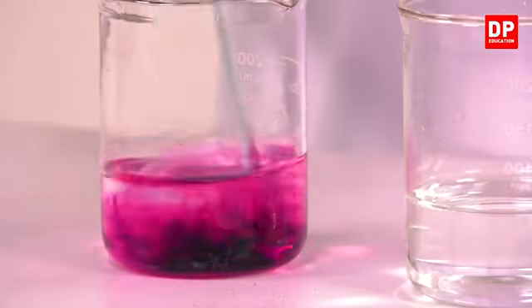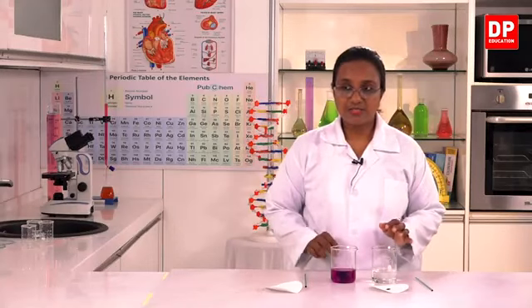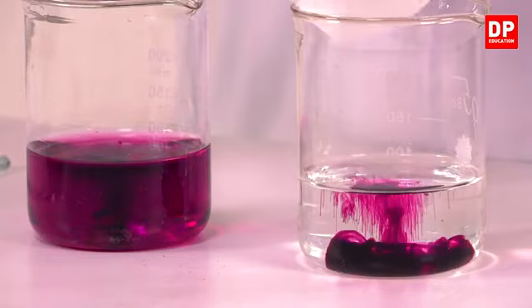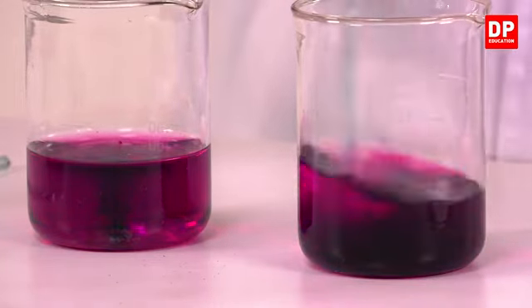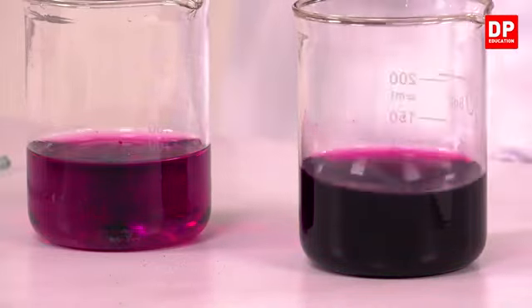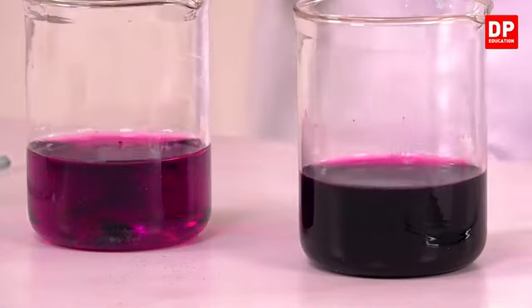So, here you can see it is a purple color solution. At the same time, I will dissolve a large amount of potassium permanganate, and when we dissolve that, it is also a purple color solution. But here you can see the difference in intensity of color.